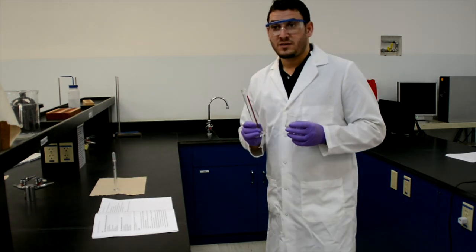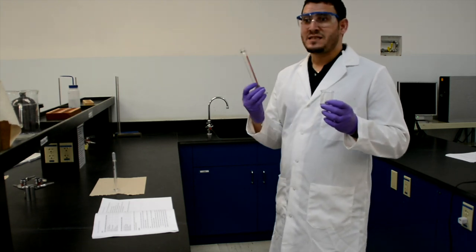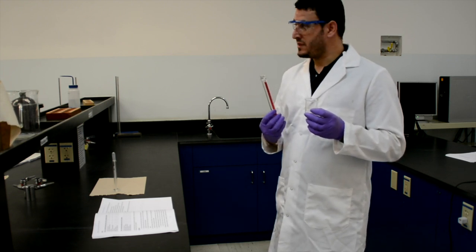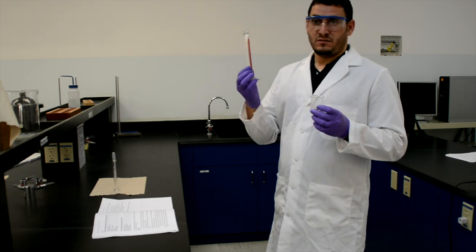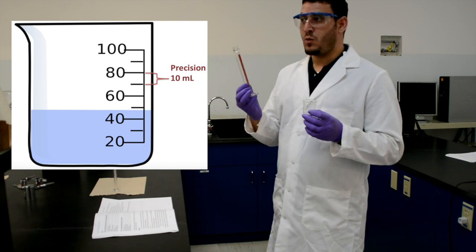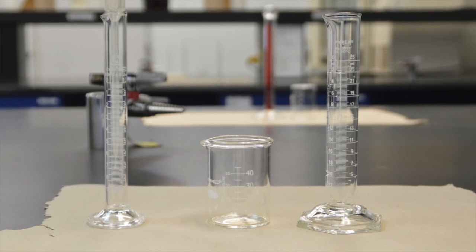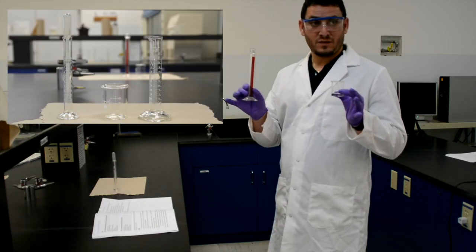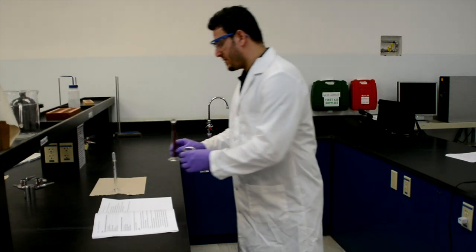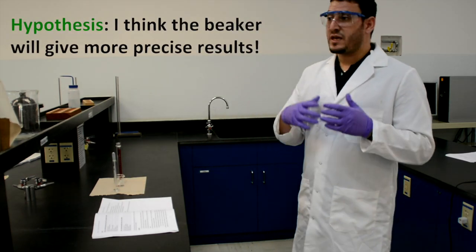By looking at the graduation on the glassware, you can tell which glassware is more precise. The glassware that gives more precise measurements is the one that has a smaller unit. You have these two glassware here — I'll let you judge which one you think will give more precise measurements.